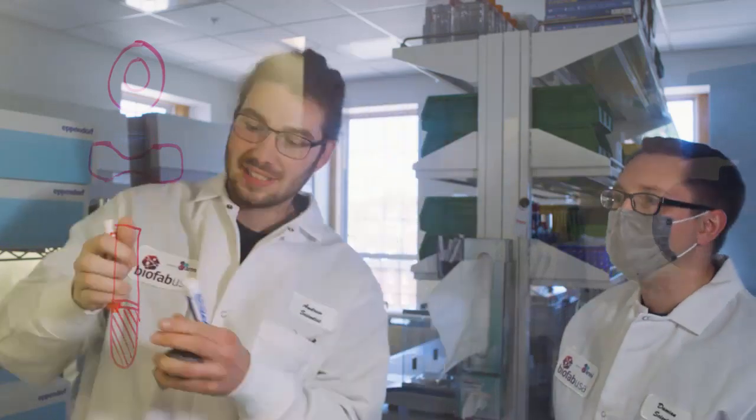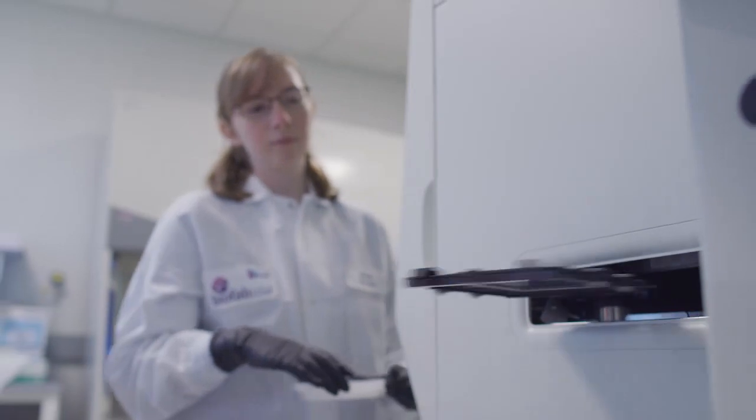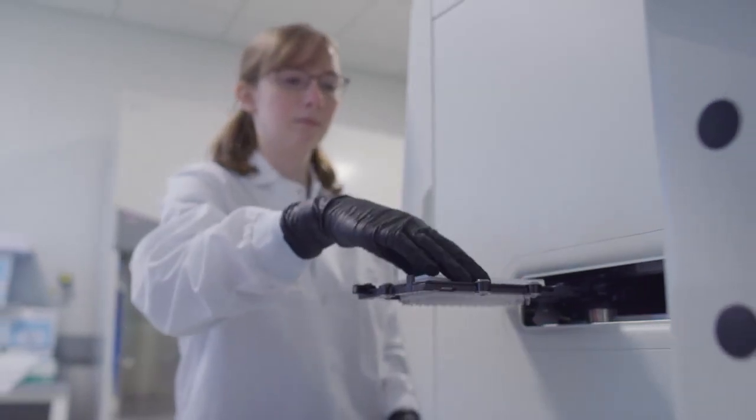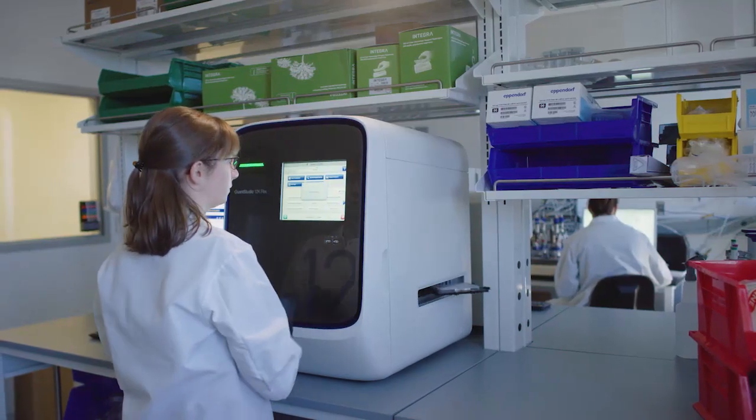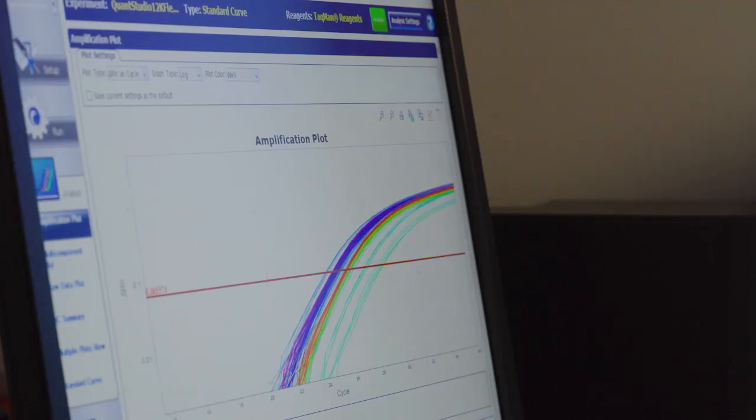We can achieve this with high-density cell culture, using cutting-edge bioprocessing and analytical technology to make the manufacturing of cells scalable, consistent, and cost-effective. Some of the process optimization that we've been working on is to integrate inline sensing into these processes to have non-destructive, non-invasive real-time metrics. Some examples of metrics that we've collected are real-time confluence and looking at different metabolites in our media to determine optimal media exchange rates.